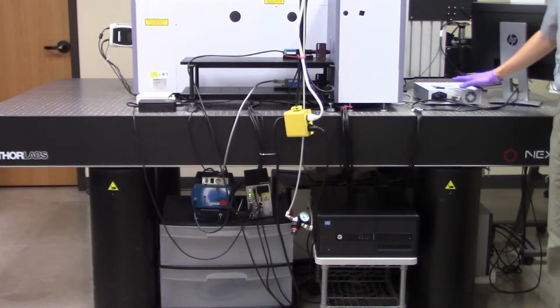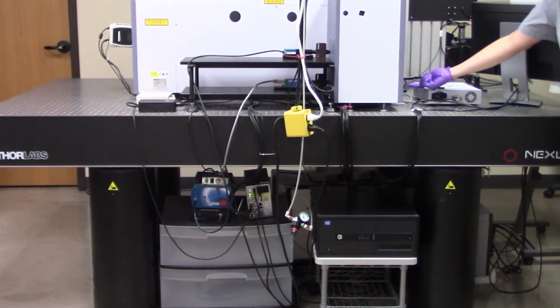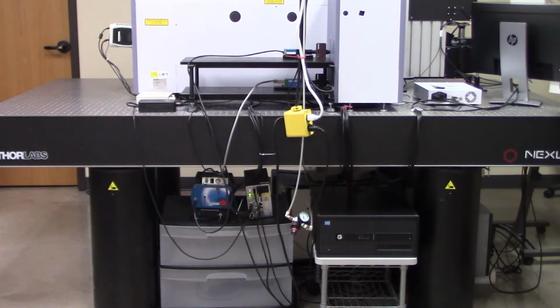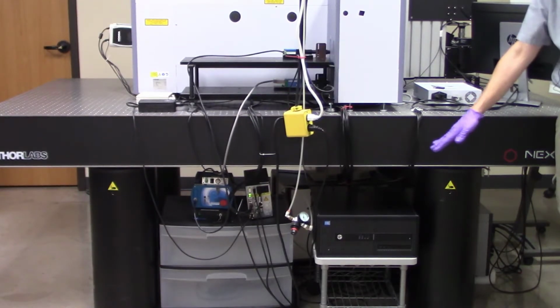The way that you would know that everything is happy with the LabRAM controller is up inside this little well that you see right here behind this laser diversion tower. You can see a set of green LEDs, and there are 4 of them. As long as those are all lit up, then the LabRAM controller has communications back with the box.